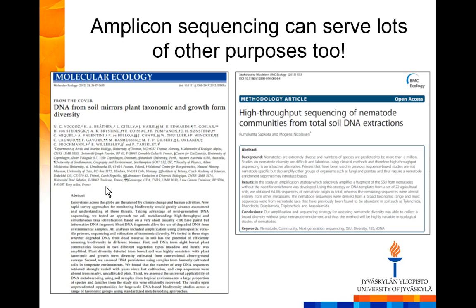With her, we actually combined, I think, amplicons from 16 or 15 different genes and parts of genes in one sequencing run, and it was successful. So you can mix and match lots of different things, even in the same run, and learn about the diversity of specific genes and not just microbial communities. Nitrifying communities, hydrocarbon degrading communities, whatever you choose, if you have good primers that produce short enough amplicons.